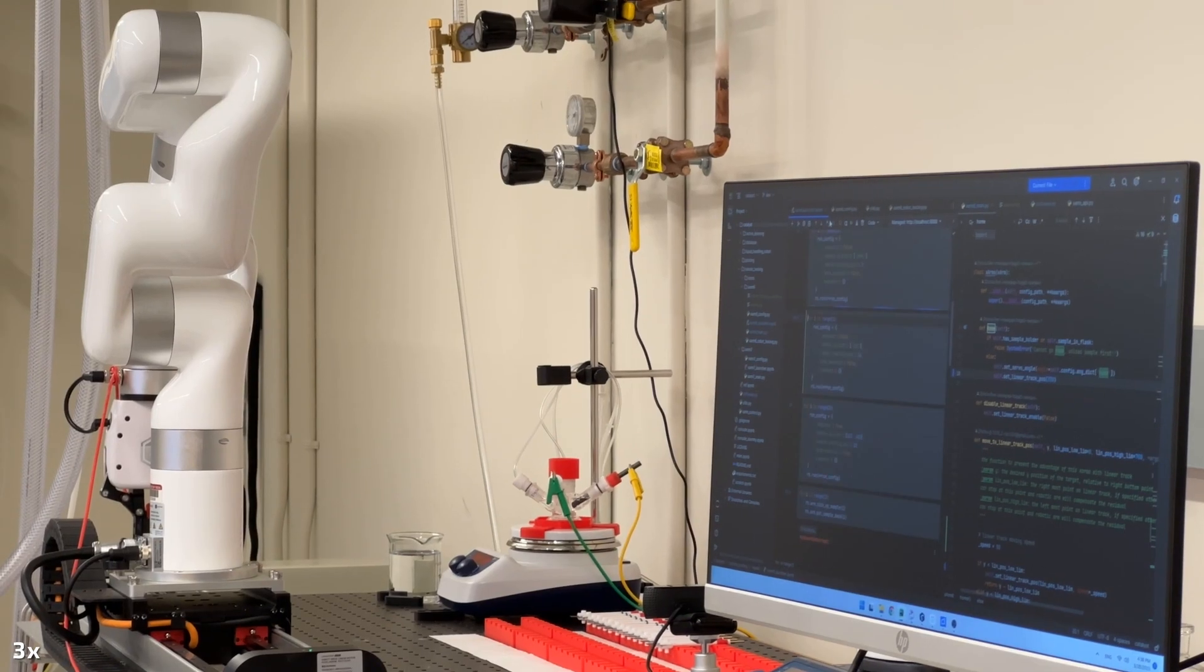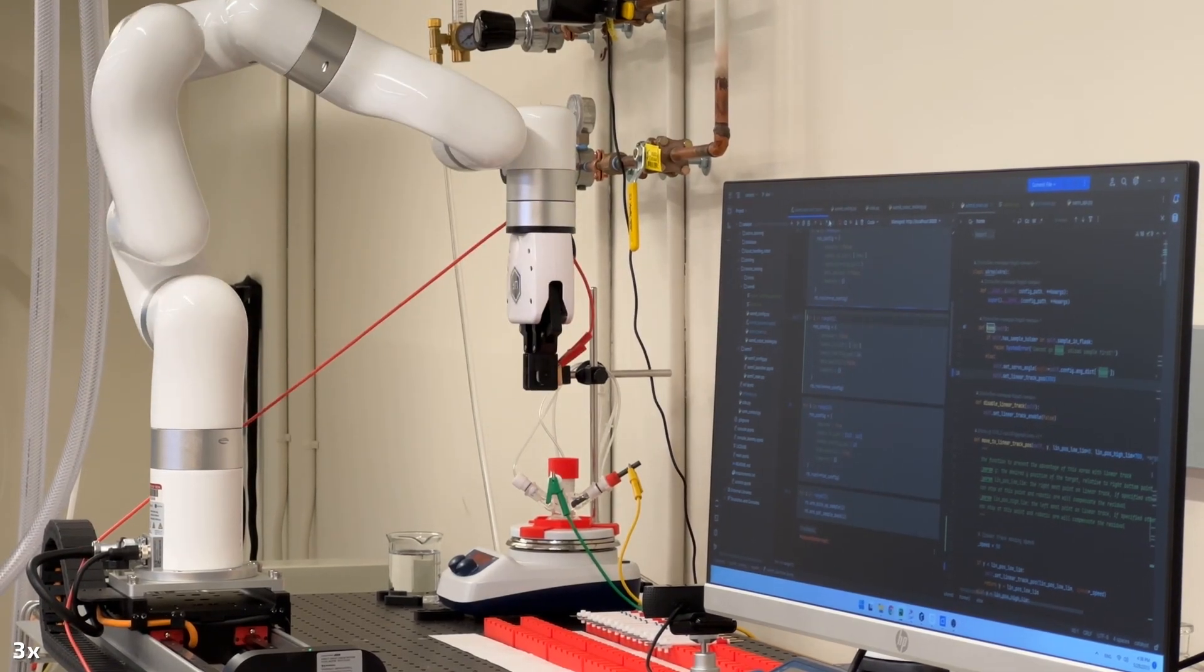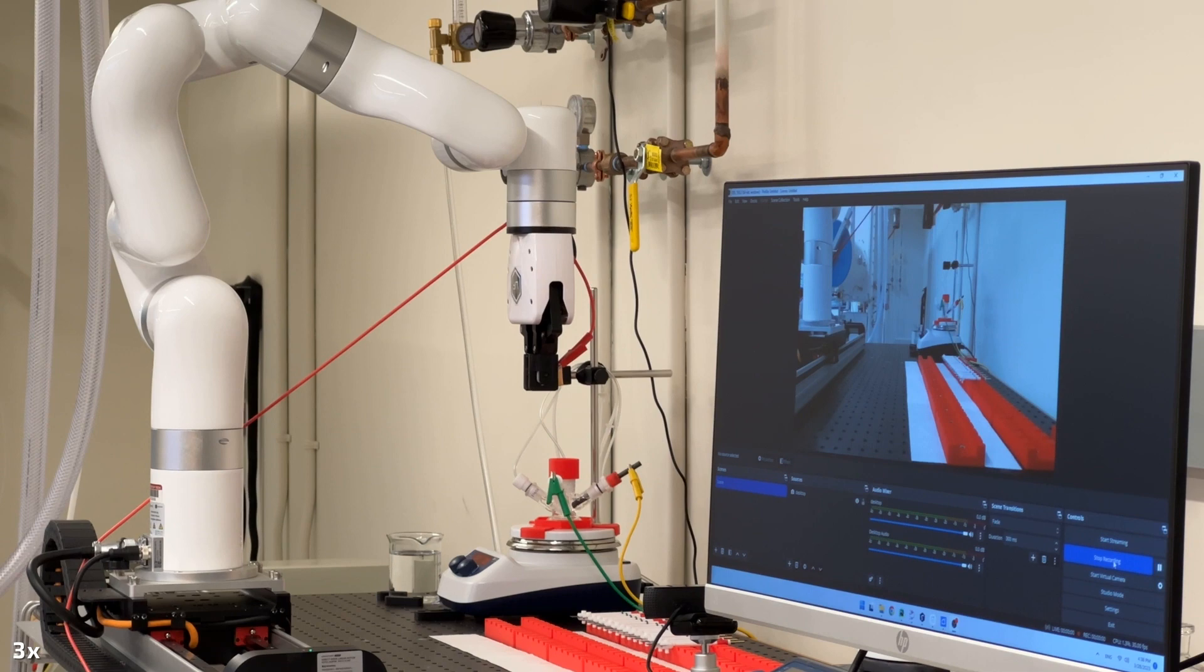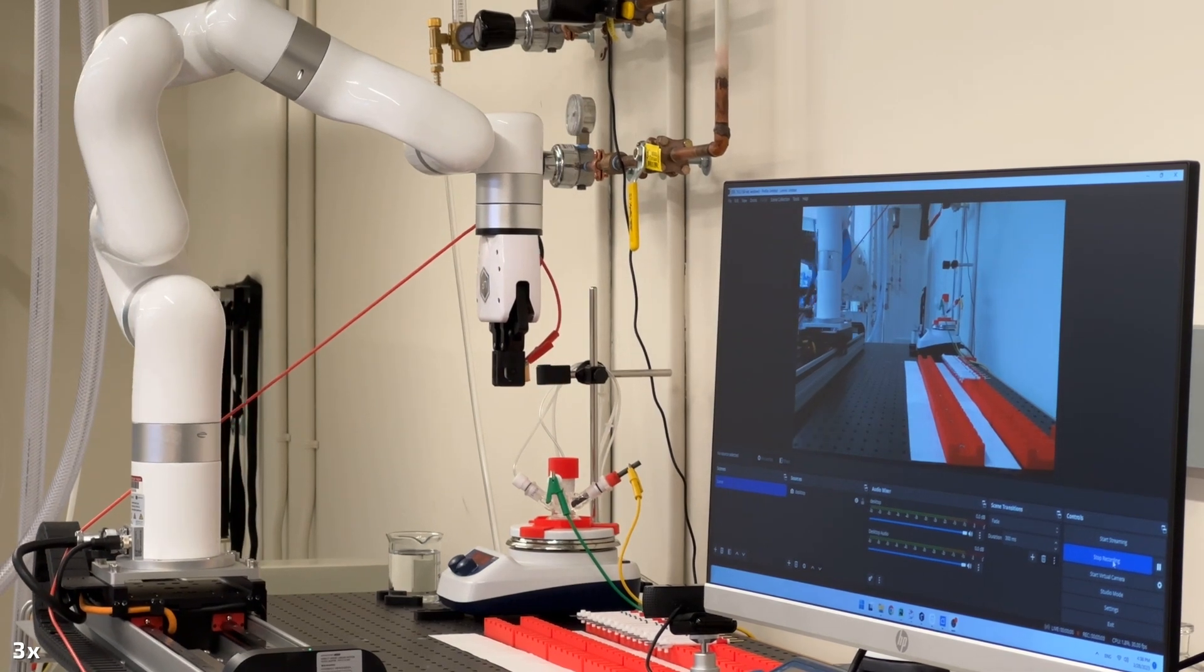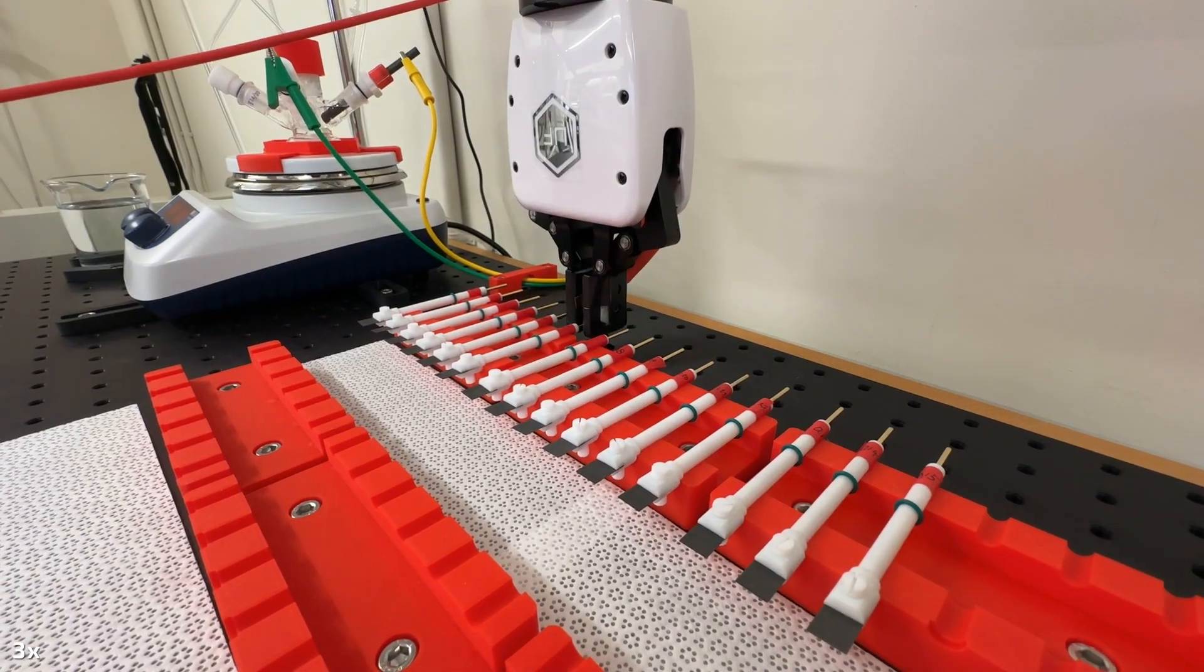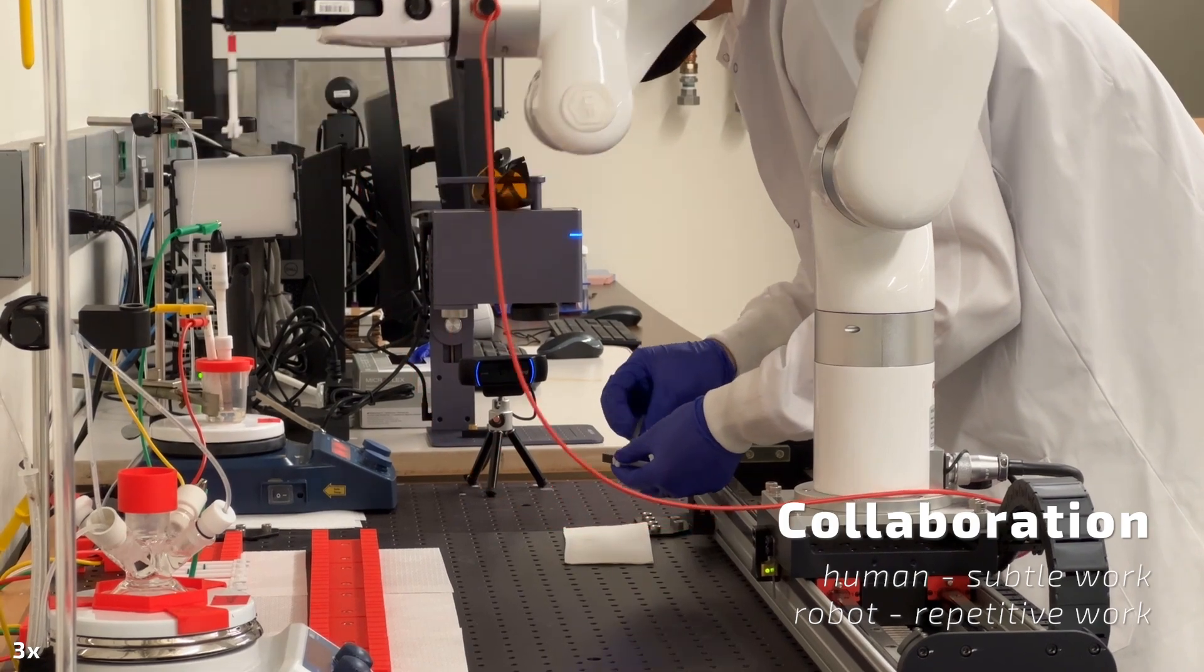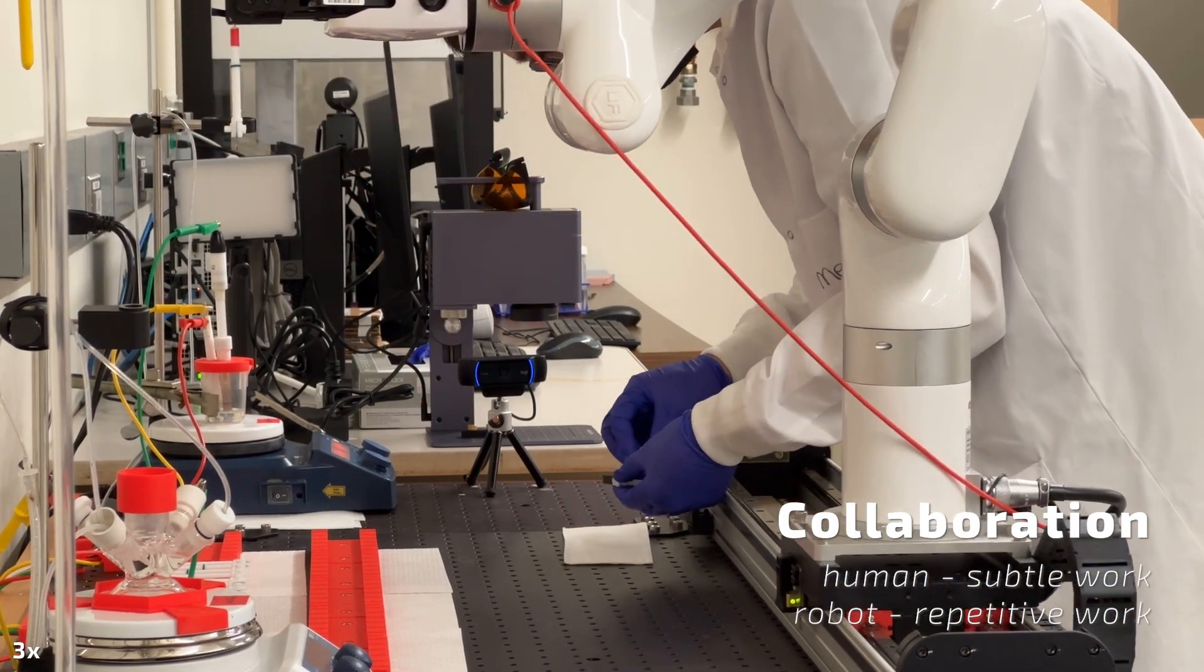I think we're ready to start the robotic testing. Hope we can get a record-breaking sample. Sure, Chu. The robotic testing platform has been started. Let's see the power of your intuition.